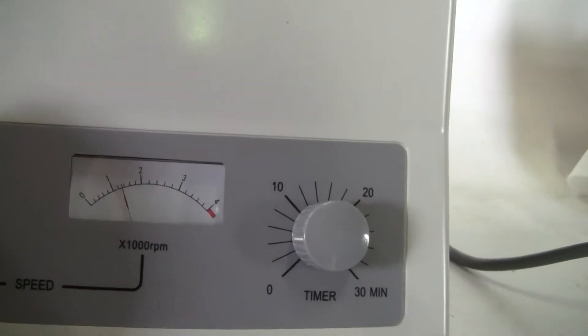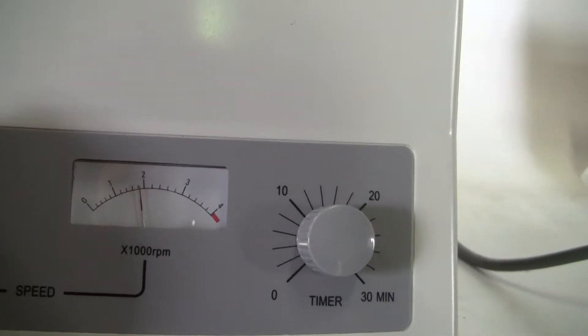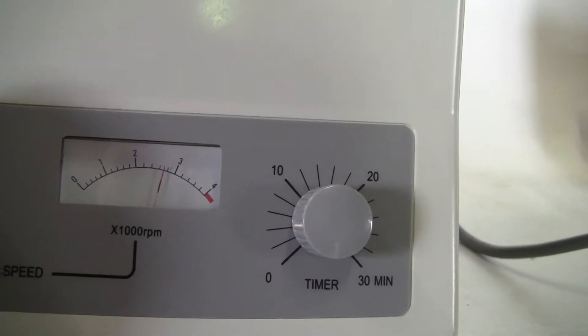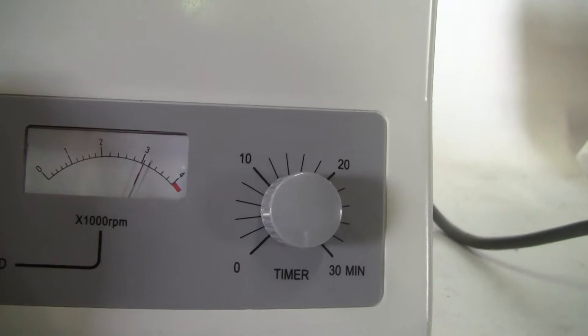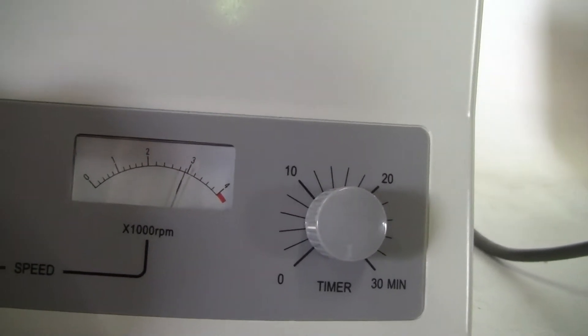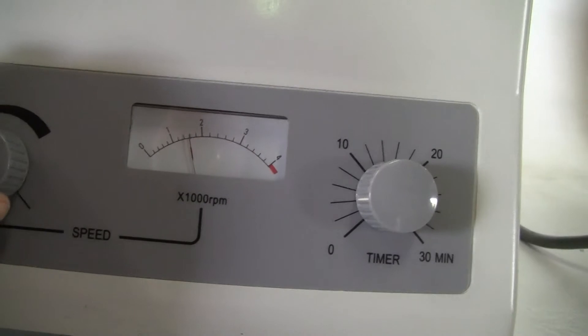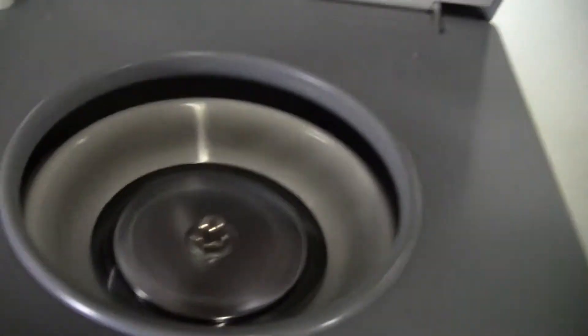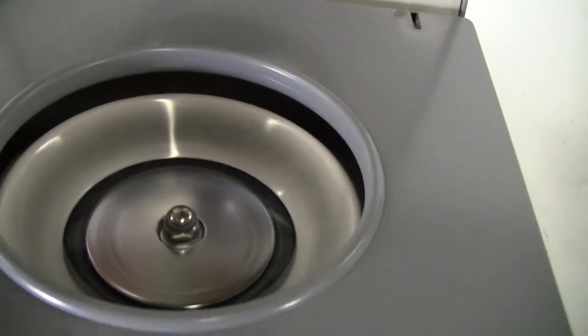You can see it going there — it's up a little bit. There you have it. Nice little machine.